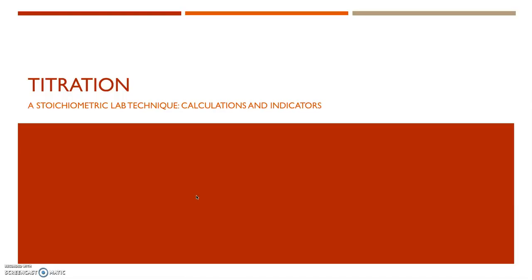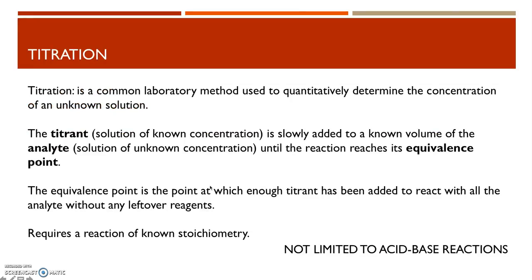So titrations are often used in acid-base reactions. They're not specific to acid-base reactions, but a titration is a common laboratory method that's used to quantitatively determine the concentration of an unknown solution. So this is not limited to acid-base reactions, but it's often used in acid-base reactions.